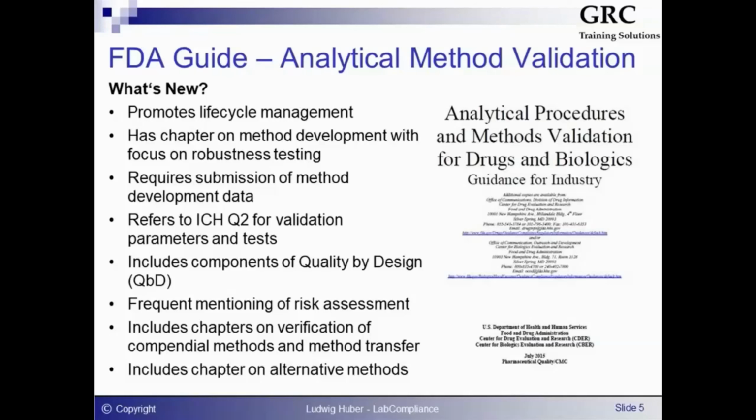Also, I think most people were expecting that this guidance document from the FDA will say something like, we should now follow the principles of quality by design.